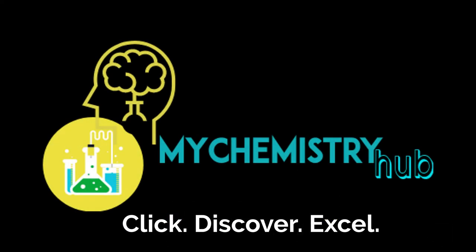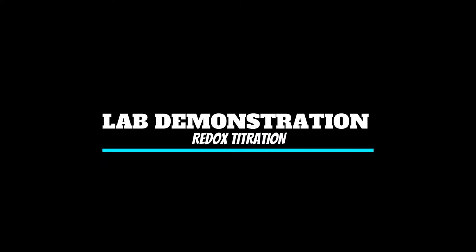Hi everyone, Sharon here and welcome to My Chemistry Hub Lab Demonstration. Today we will be doing a Redox Titration.